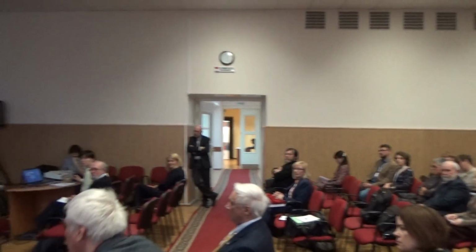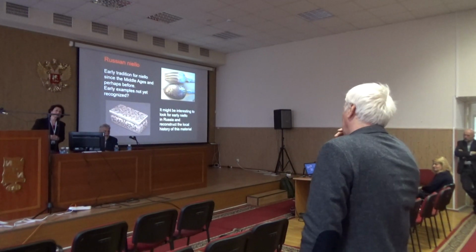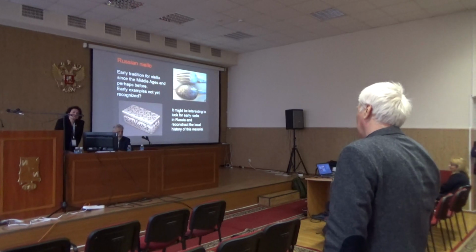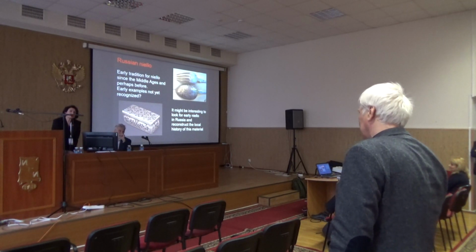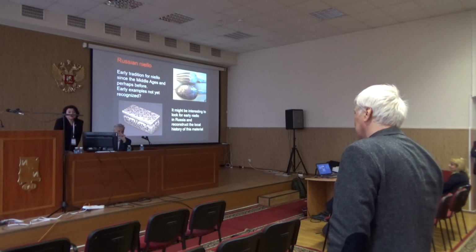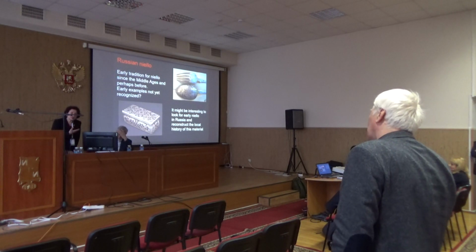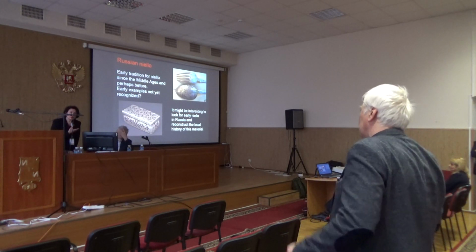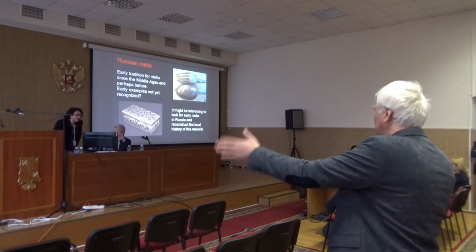Please. Thank you. My one question: is mercury used in applying methods of niello? Which method? X-ray diffraction, at first X-ray fluorescence. Only silver niello, is mercury applied to make niello on the surface?